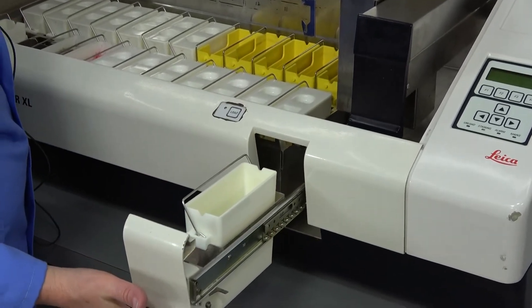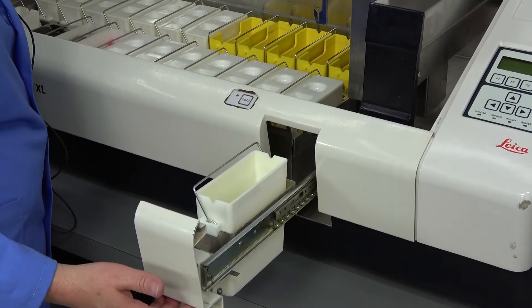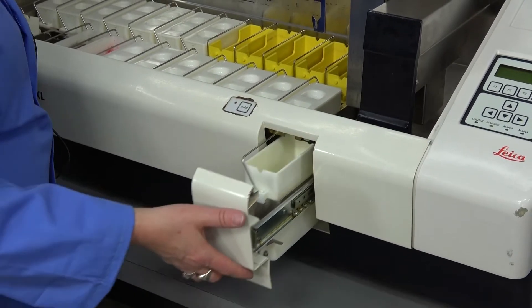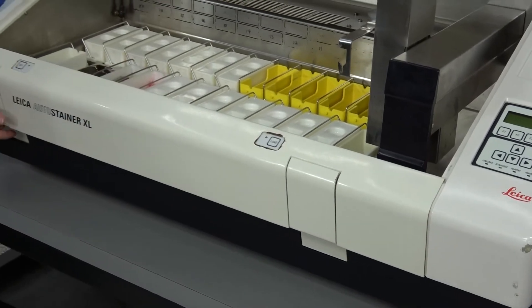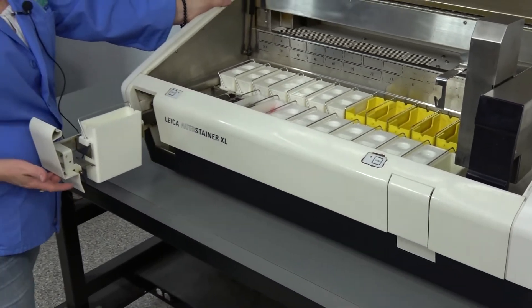This is where you would load your slide baskets. After it runs through the procedures you unload on this side.